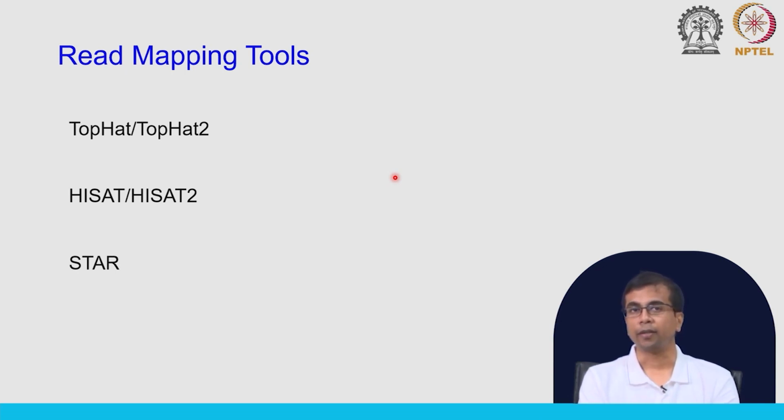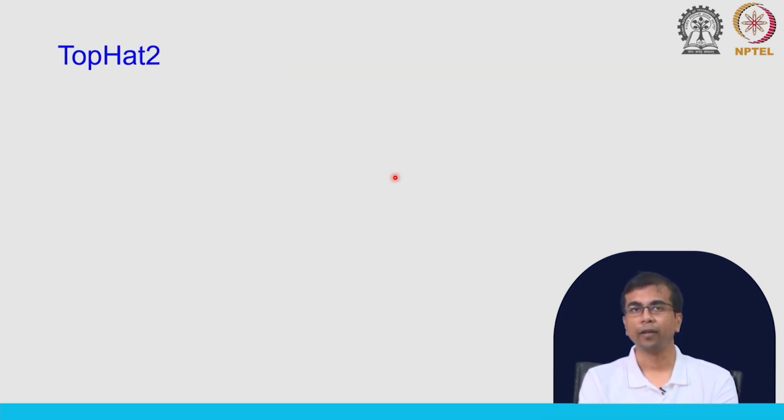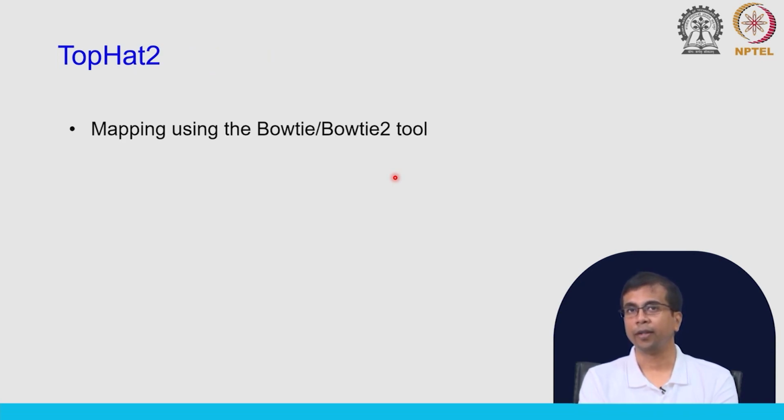Then there is the class of tools called HISAT or HISAT2, which is also quite widely used now, and you have STAR. Of course, there could be other tools, and we are not going to discuss all of them. These are some examples of very popular tools that we can use. TopHat2, as I just mentioned, did mapping using the Bowtie tool.